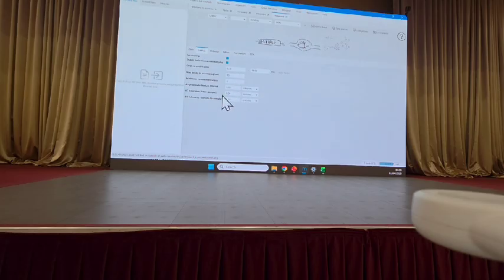The retention time tolerance between sample to sample is now, let's say you have one metabolite in 3 different samples, and it's the same metabolite in 3 different samples. Does the retention time shift between each injection? It can shift a little bit. Again, this is really up to you to know how well your instrument is conditioned, how well is the state of your current column life. And again, default settings worked quite well for us, 0.1.